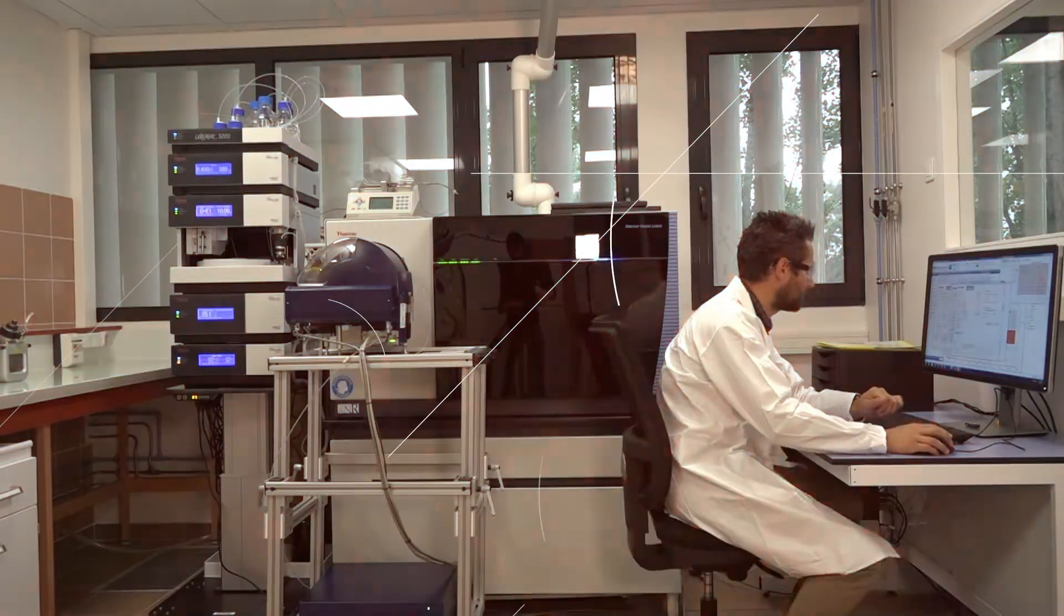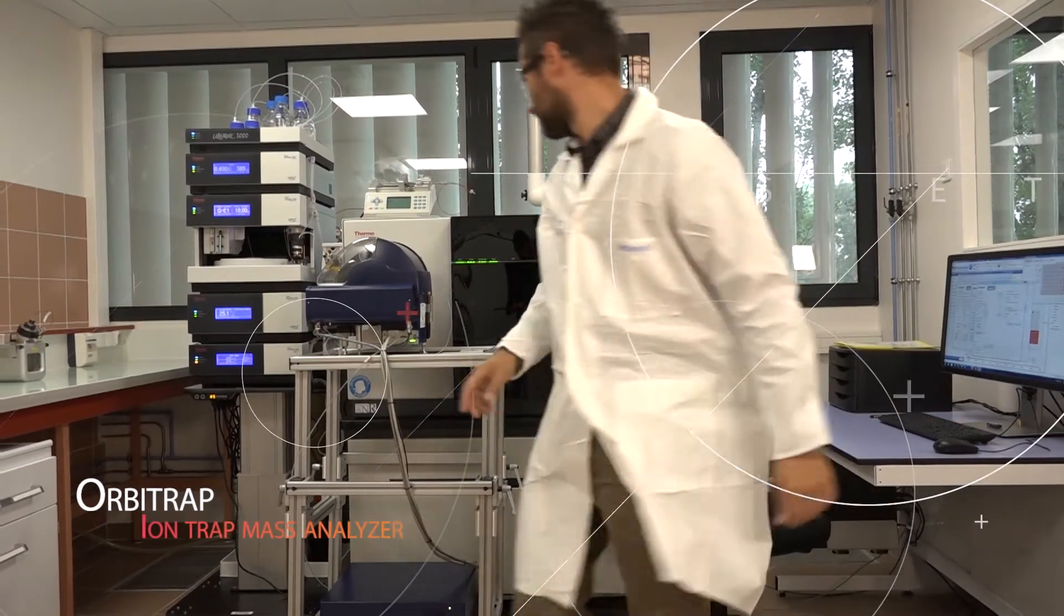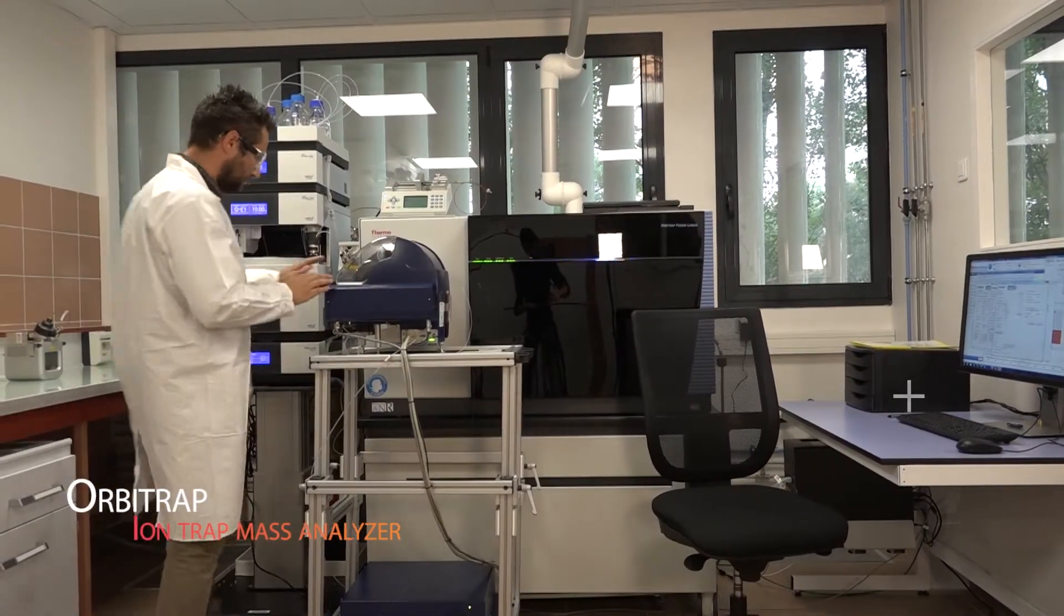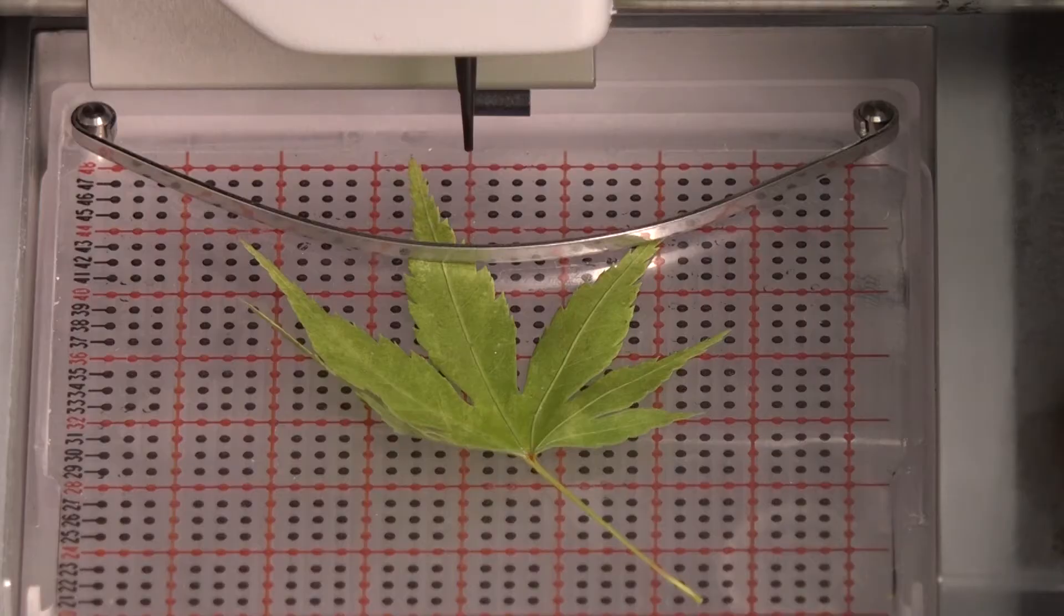The goal of our work and one of the hot topics of analytical chemistry nowadays is the identification and structural characterization of biomolecules containing trace elements. This difficult task requires high performance analytical tools such as high resolution mass spectrometry.